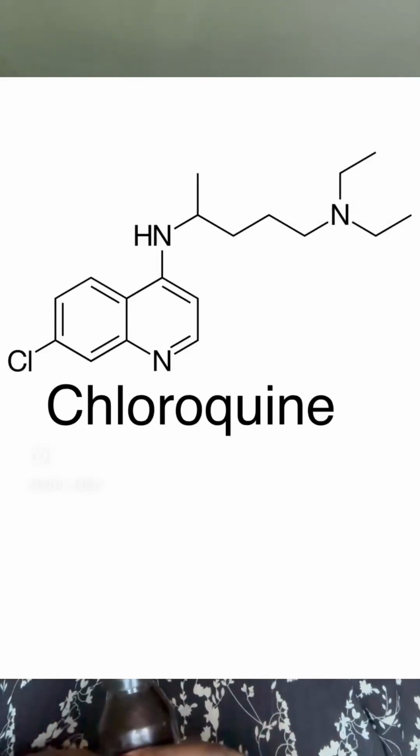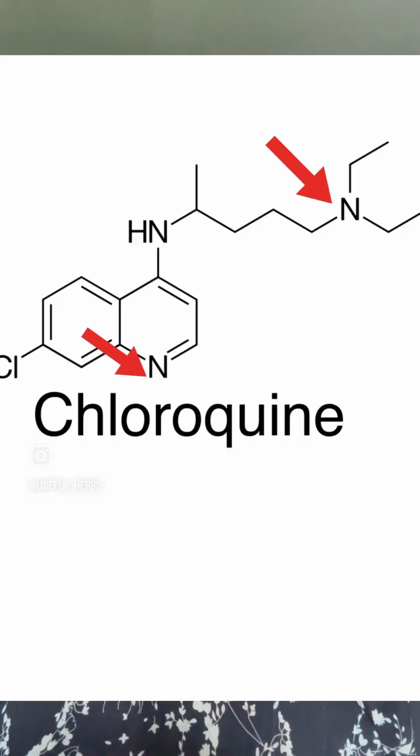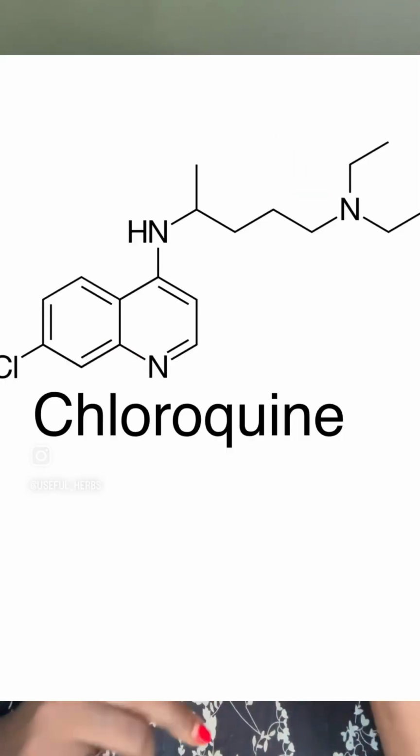Now for Dragendorff's reagent, if you've been paying attention to my page very well, I've actually taught how to make it. I think I did the video October last year, October 22nd. I also put a video of it on YouTube. In the video on YouTube, I actually used this Dragendorff to test for the content of chloroquine in a tablet. Mind you, chloroquine is an alkaloid, and in that video the Dragendorff's reagent gave a positive result for alkaloids. So you can see how useful this reagent is.